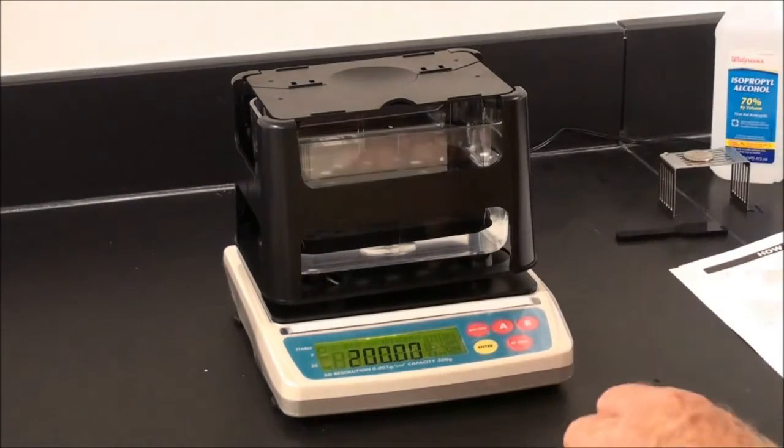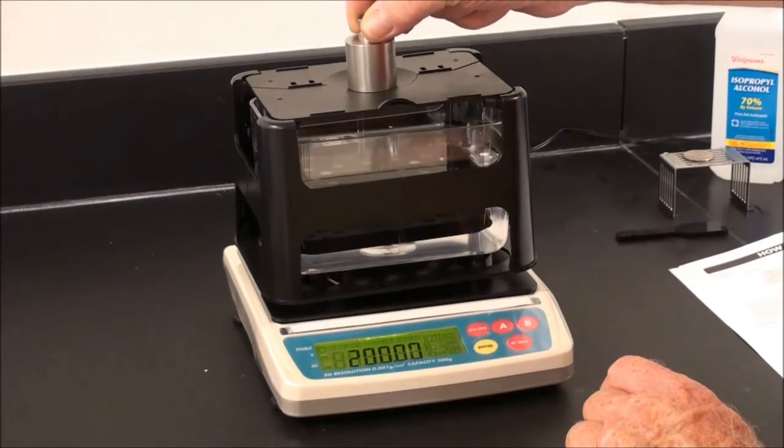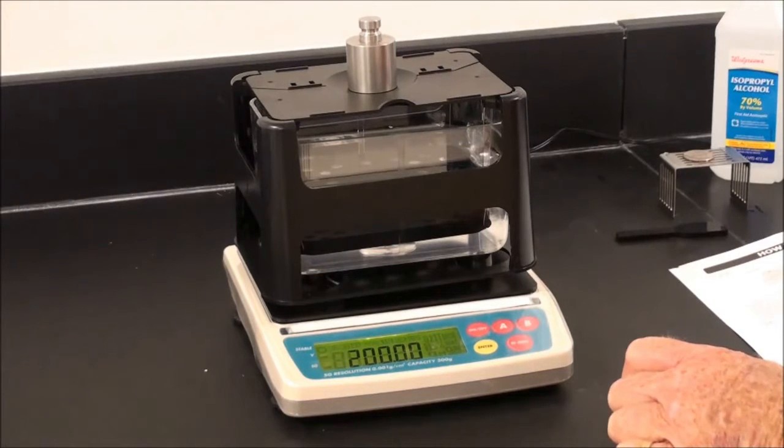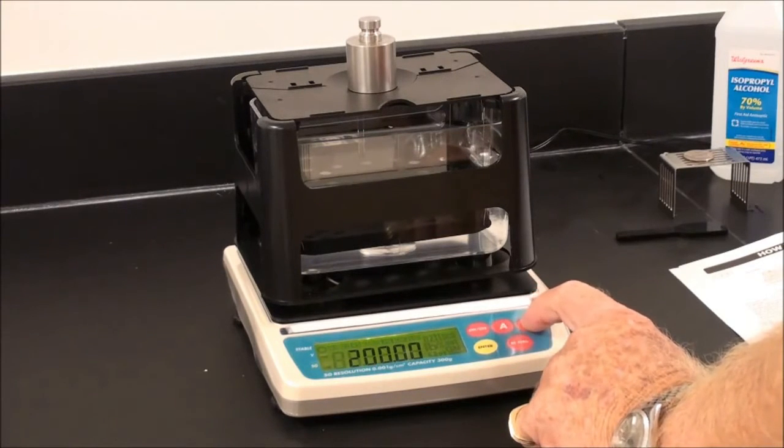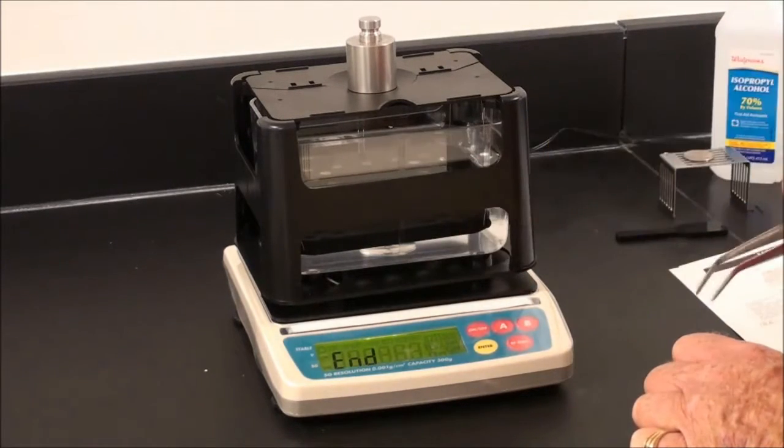Take the 200 gram weight as shown in the display, place very gently on the aerial sensor. Now press the B key, the stability mark appears, then end will be displayed.